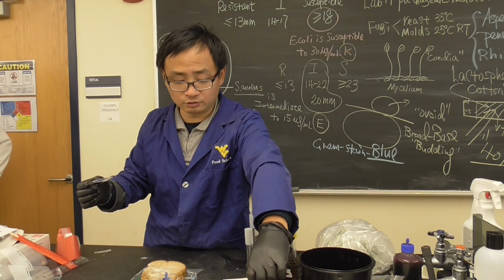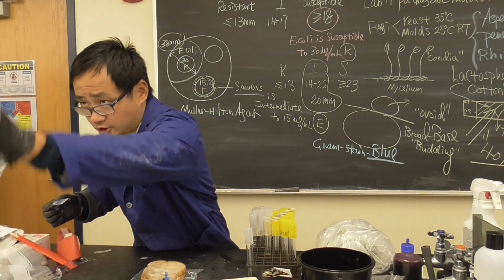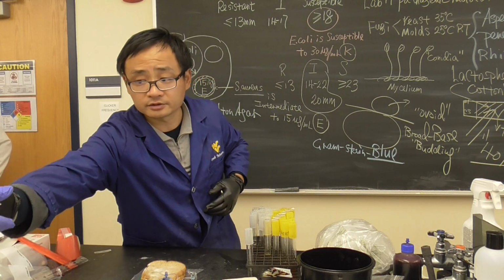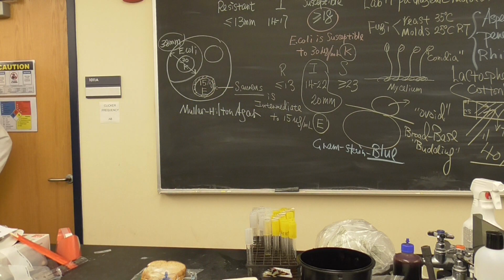Okay, so these 2 will be given to you, and this will be given to you. You guys could share the whole bench. This will be your slides. Okay, that's the first one. We'll do these one by one. Is that okay? So let me turn off the camera first. Then we can go ahead to do these one by one.